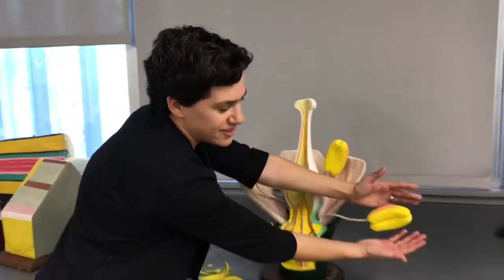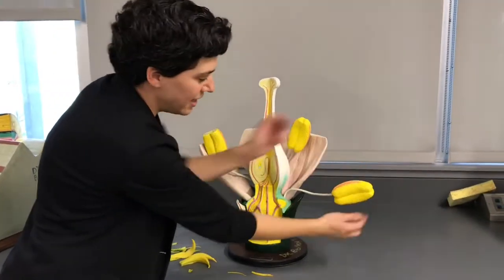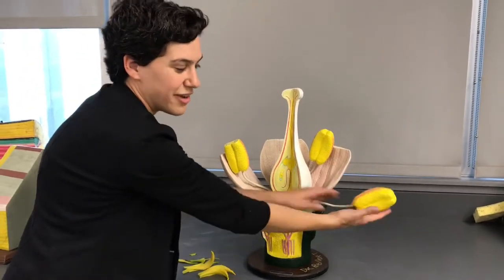So on this model, this is the anther, where all the pollen is. And this is the filament. And together we have a stamen.